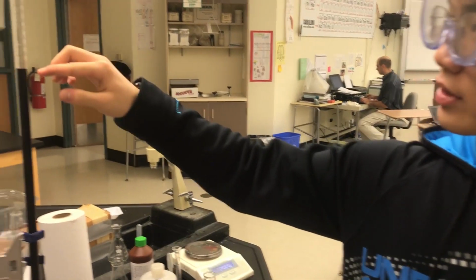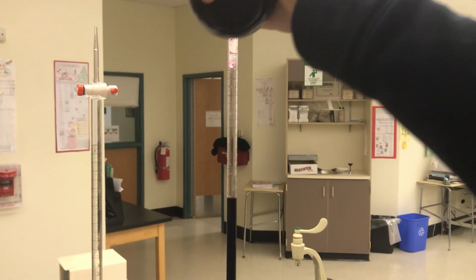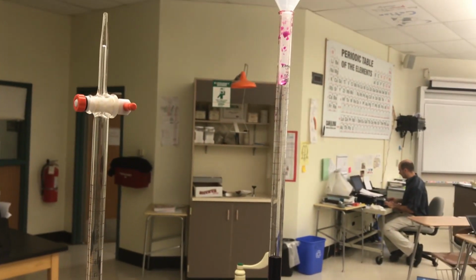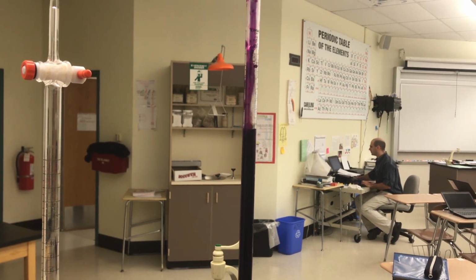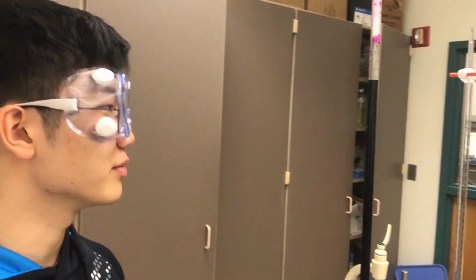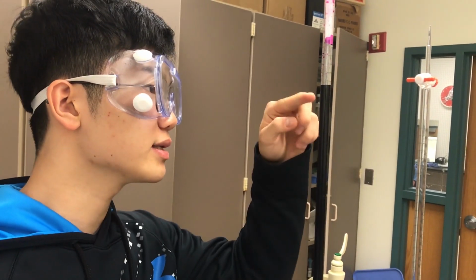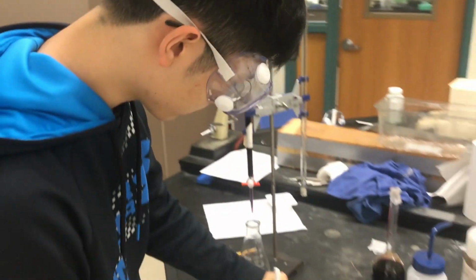So don't forget to fill this back up to the top. Just make sure it doesn't go above 0. It doesn't have to be perfectly the top, but it has to be close, because you're going to need most of this solution for the titration. Oh yeah, and don't forget to record the initial volume on the burette. So in this case, it's about 4.45 milliliters.